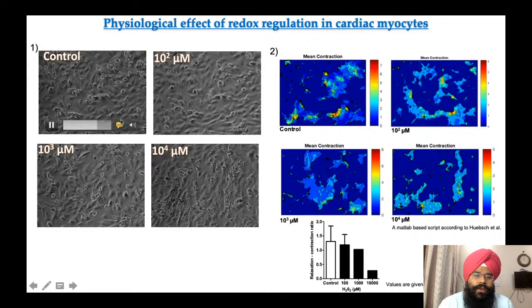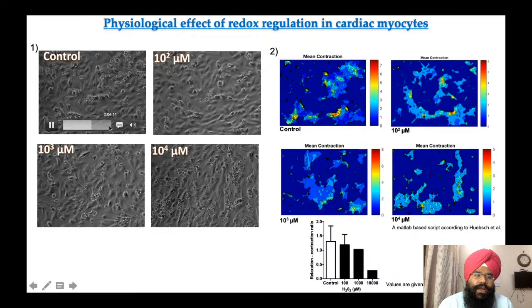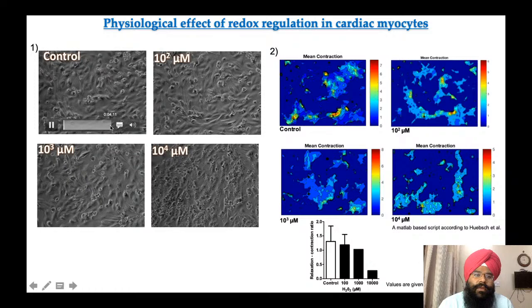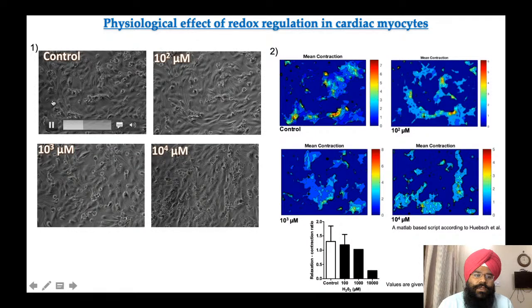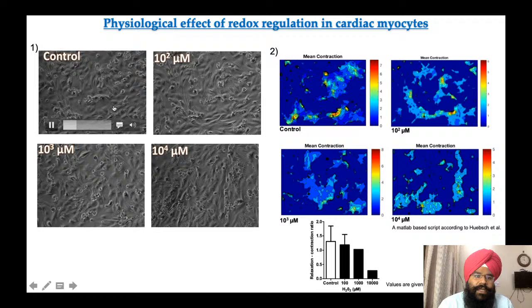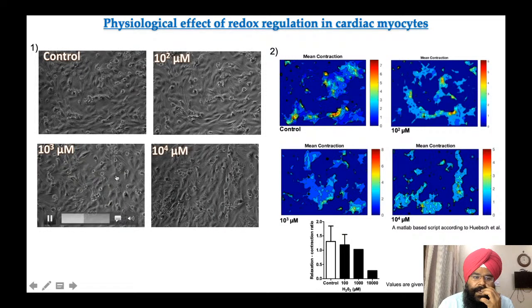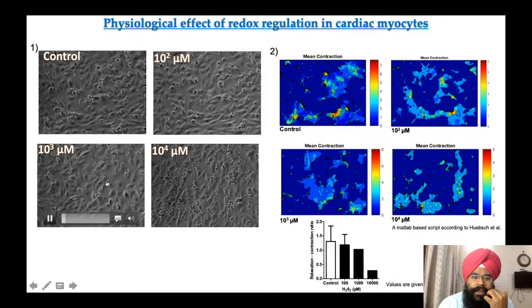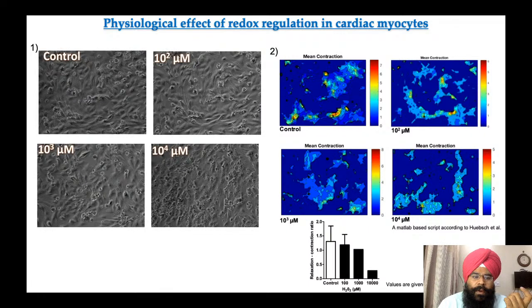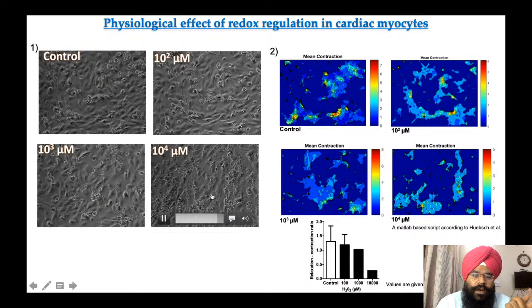It's a 4-second video, but it took me 24 hours to make, so this is the fast version of it. What you can see is the heart pumping, the cells pumping within themselves, and here nothing is happening. Here you can see the cells start to pump slower, and here they all die. All the nuclei come out, and nothing is happening.